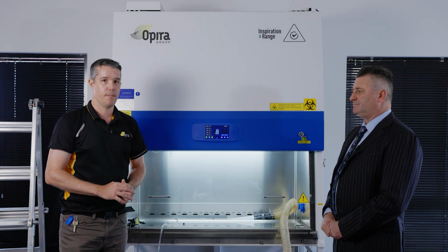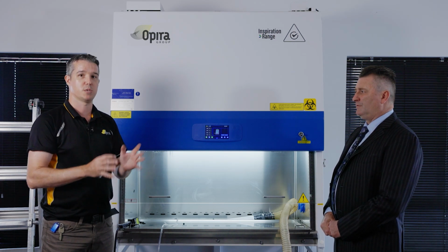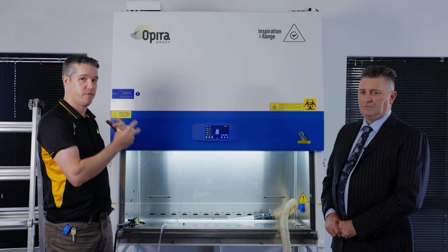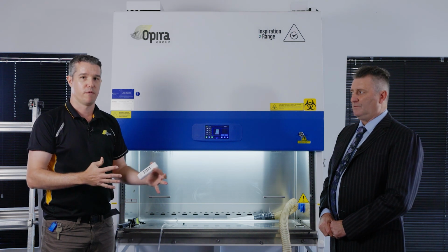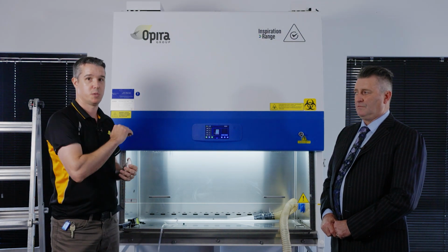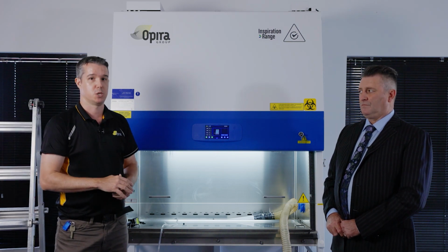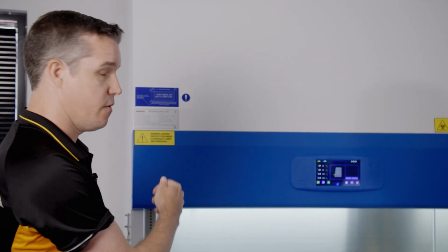The other thing I neglected to mention was the test method requires, in ideal circumstances, an airflow across the filter between 0.3 and 0.6 meters per second. However, it has provision, if you can't achieve that, to just make note of those positions. And whatever the highest reading is on those filters, based on the velocity test we just did before, you must record the position of that velocity reading as well. When you're doing the scan, you are scanning with the pleats of the HEPA filter.